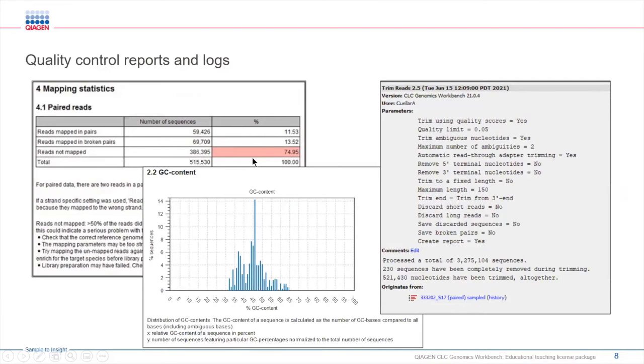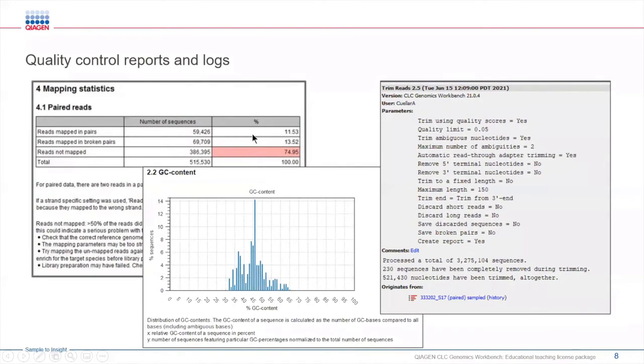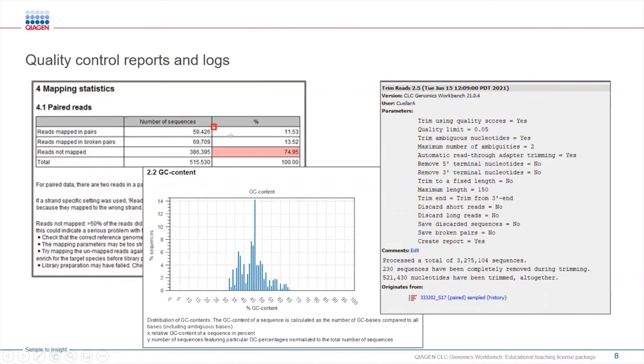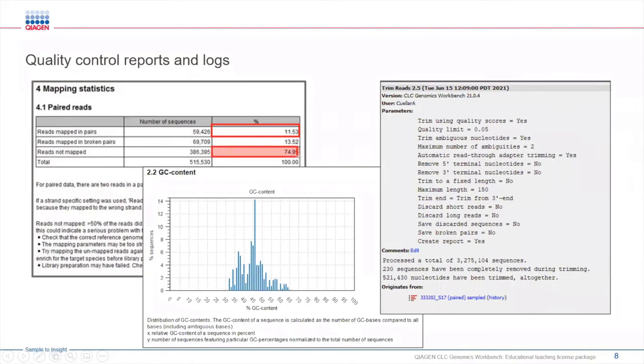It will show you things like the GC content within your reads, and then how many reads were mapped versus those that were not mapped. As we can see here, approximately 12% of your reads were mapped, and then 75% of those were not mapped.